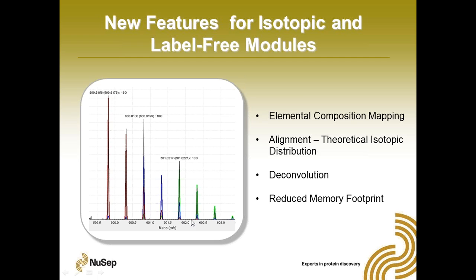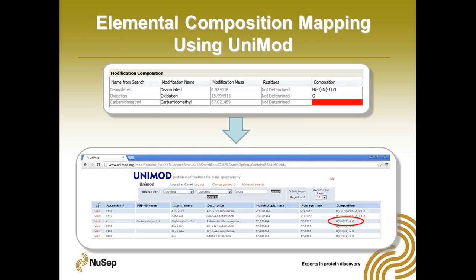This is an image of the new ability to look at theoretical isotopic distributions overlaid on your experimental mass spectra. This is actually showing a fairly complicated sample. This is O18 labeled peptides. So here we see the native O16 labeled peptide, 1 O18 label, and 2 O18 labels. And you can see each of these groups has a separate distribution overlaid. That allows us to deconvolve these and correct for underlabeling, which we'll go through in a bit. So it's a nice additional feature.